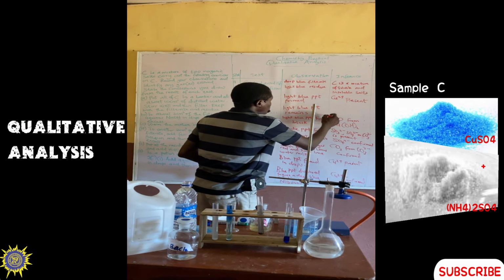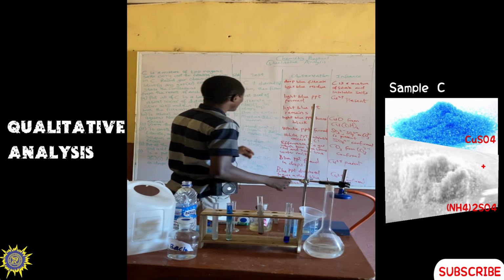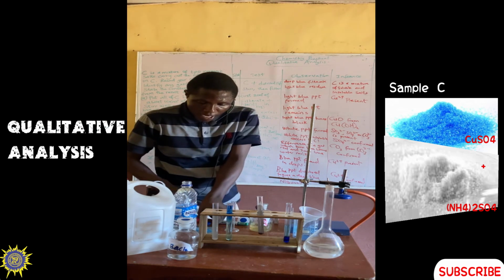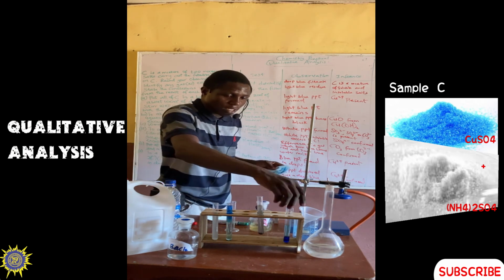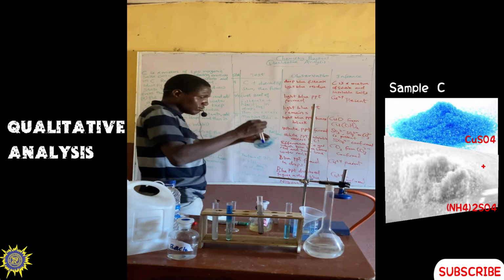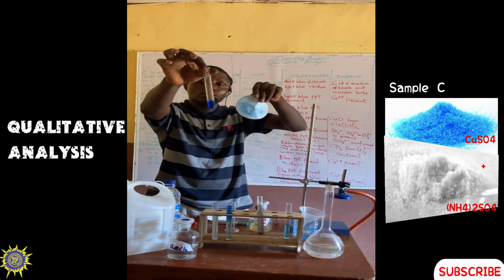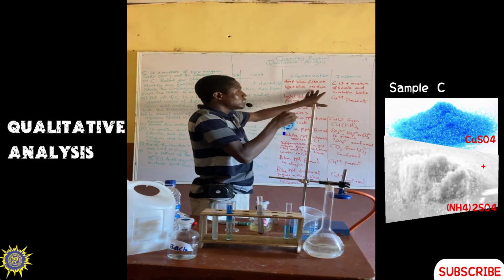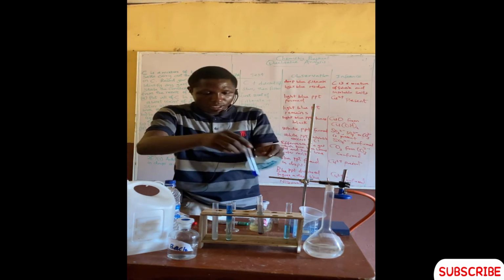So we have come to the end of the analysis here. Let me separate it very well so that you can see it. So here is the analysis: the first one, the second one, the third one. The first one gives us filtrate and residue. We are asked to mix C in water and then filter, which gives us a residue and a deep blue filtrate and a light blue residue. So that's why C is a mixture of soluble and insoluble salt. So that's the first question asked.